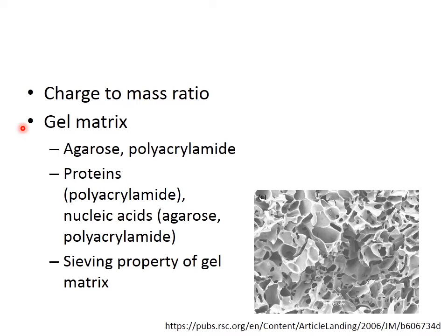Those molecules which are smaller can migrate easily and therefore they will travel a greater distance. The molecules which are larger in size will migrate at a slow rate and hence they will travel less distance within the gel. So based upon the relative distance they travel, these molecules will be separated from one another.